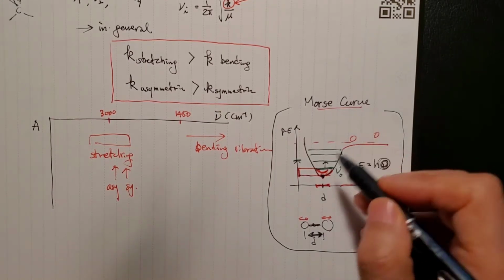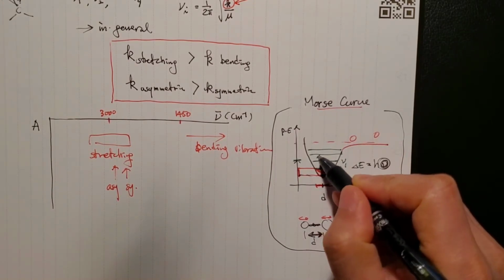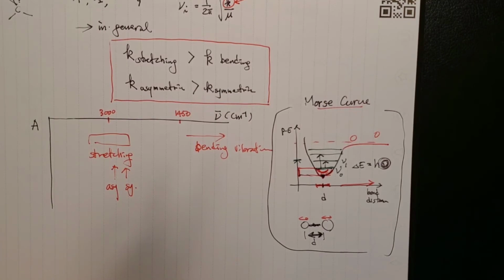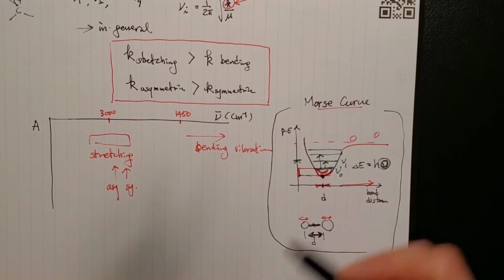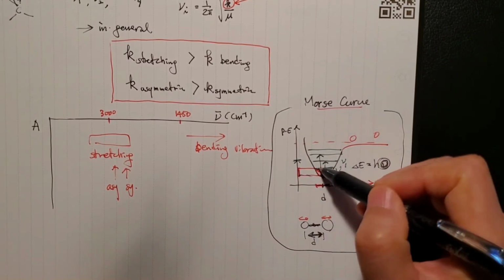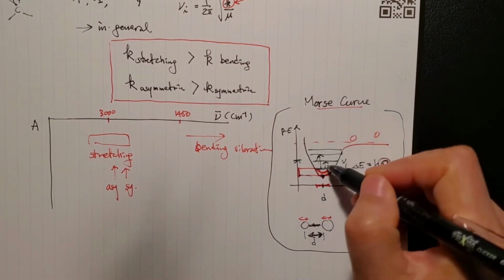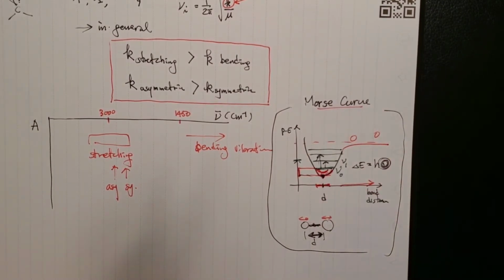But from time to time you see this jump, because these days the spectrum is run with a laser, or in some other cases the frequency happens to be twice that of the other functional group. Then this could happen for a functional group that you're not aiming at the moment, but it just happened. So this transition had twice the energy.